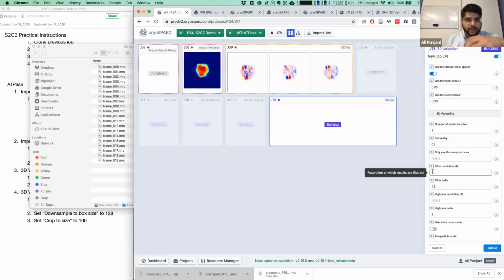That track will show you an unbiased, unmodified view of what kind of heterogeneity there is in the sample, whether it's discrete or continuous or any kind. If there's both kinds of heterogeneity, what I'm imagining in this scenario is that you have a particle that exists in multiple discrete conformational states, and each one of those states also has within it continuous flexibility.